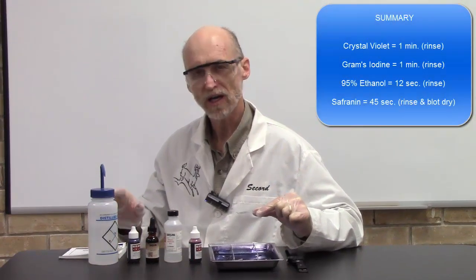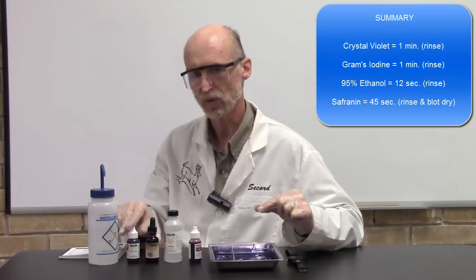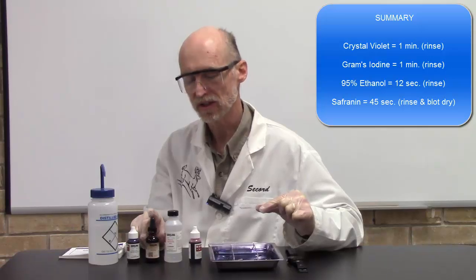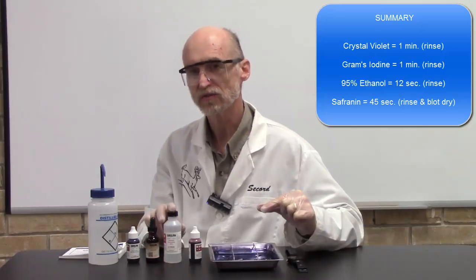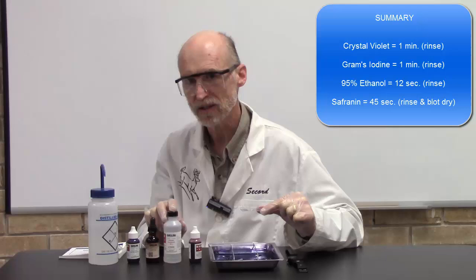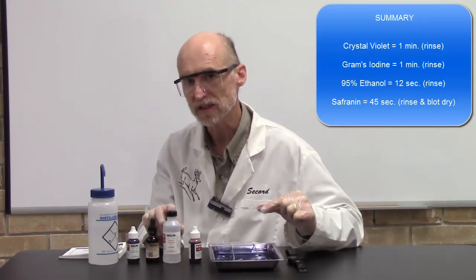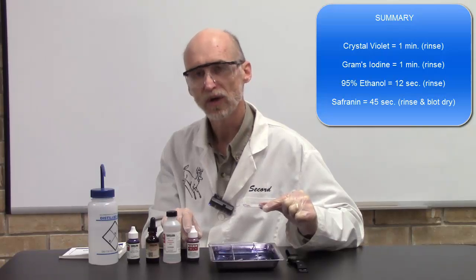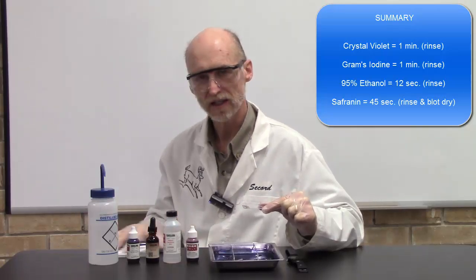Let me go over your times again. We put on crystal violet for one minute and rinsed. We put on iodine for one minute and rinsed. We put on decolorizer for 12 seconds, rocked it back and forth, and immediately rinsed. We then put safranin on for 45 seconds, rinsed the slide, and blotted it dry.